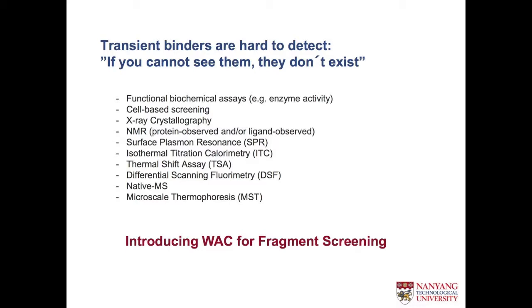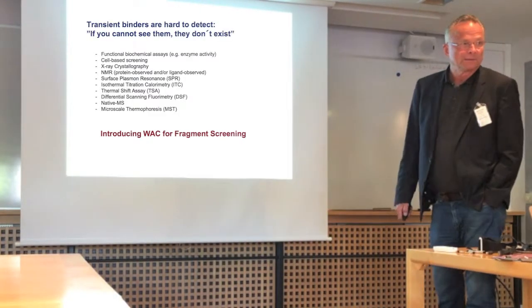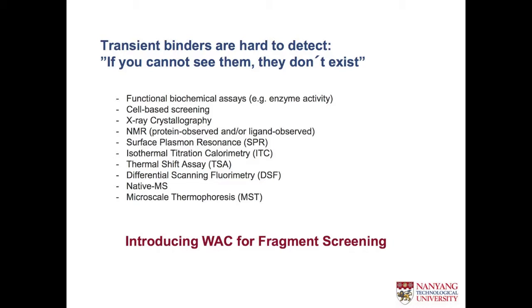So here is just a list of all the different types of assays we're doing for fragment screening these days. And I'm now trying to add a new kid on the block, WAC, for fragment screens. In the following slides, we're going to argue why we should do WAC.